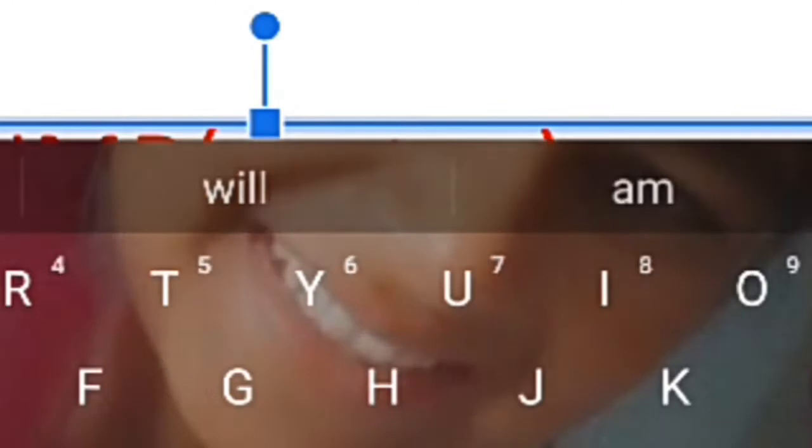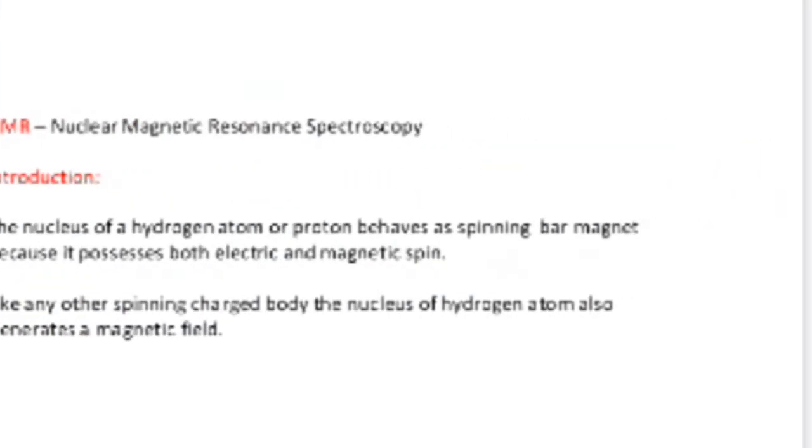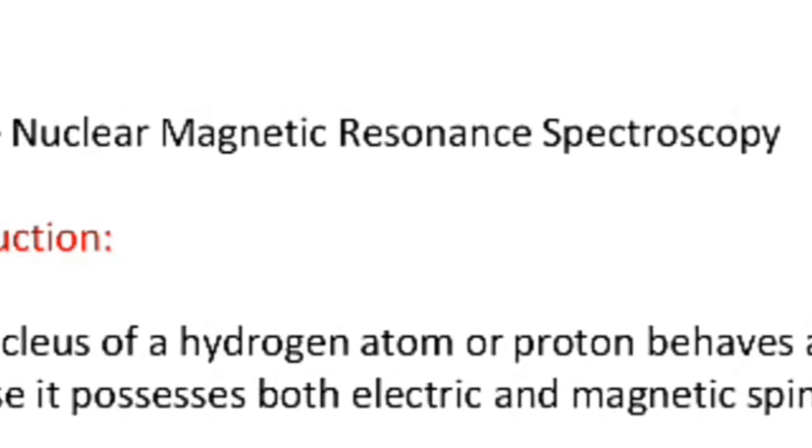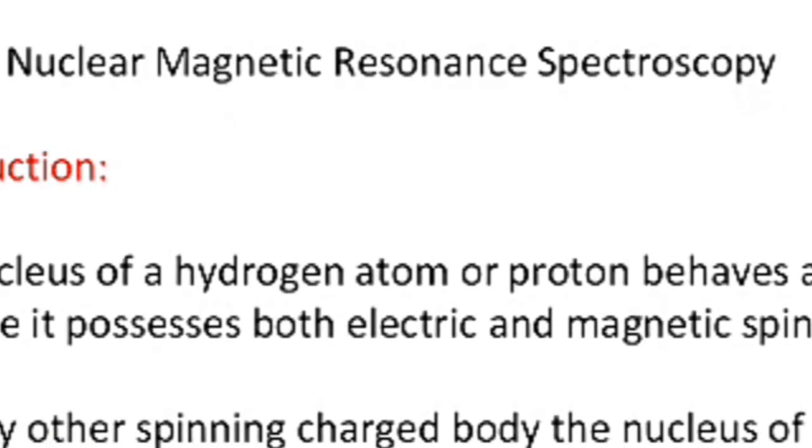Let us see here. NMR, nuclear magnetic resonance spectroscopy.